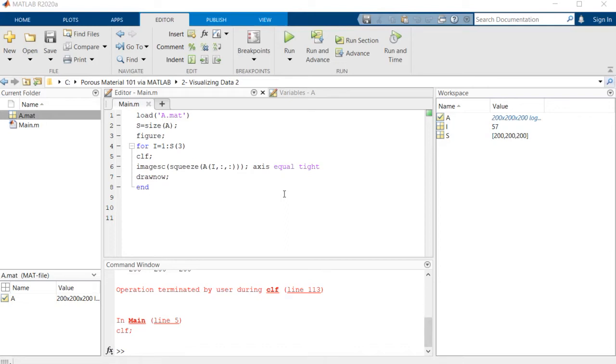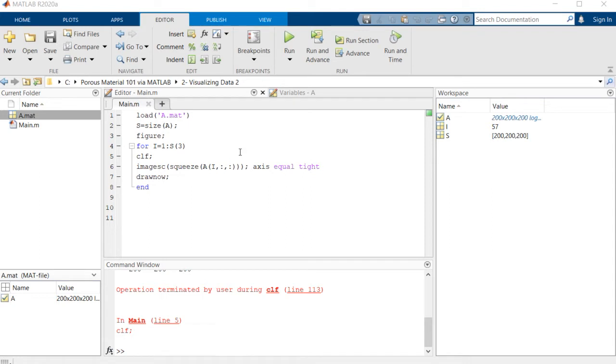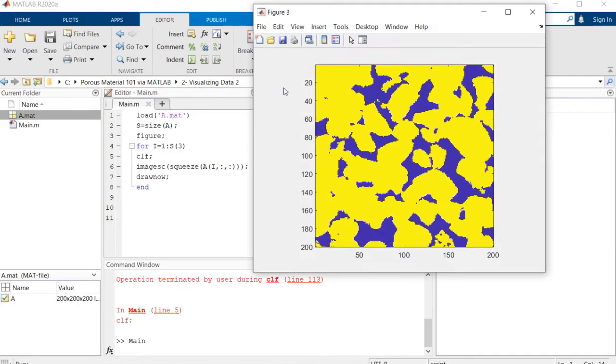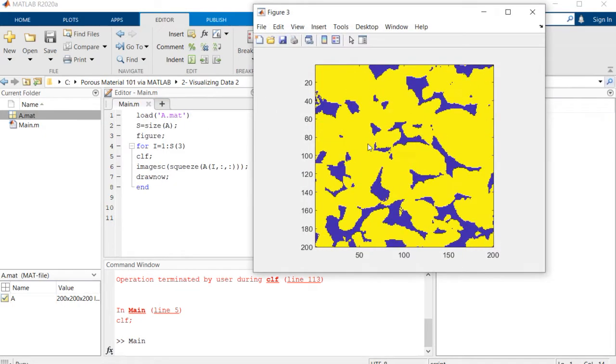Hello everyone, this is Porous Material 101 via MATLAB session 2. I'm Arash and here we want to talk more about visualization of porous material images. In the last session we visualized some porous material images with different formats and sections. I have the code here and you can see different slices of this porous material showing as some sort of animation.